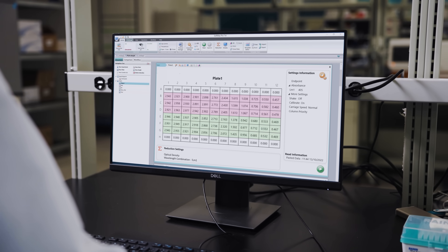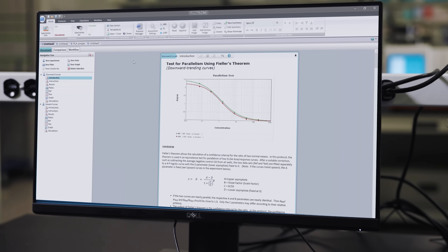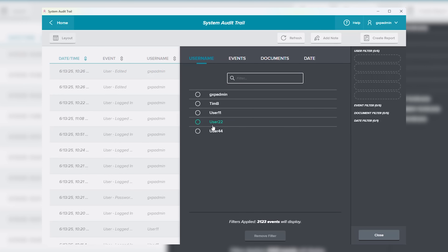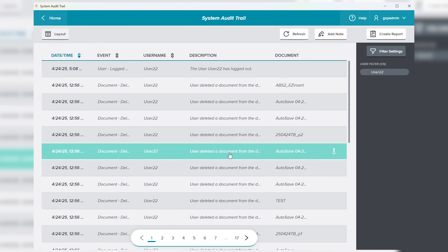SoftMax Pro software delivers powerful data acquisition and analysis with over 200 ready-to-run protocols for ELISA, cell viability, and more. Built-in compliance tools support FDA 21 CFR Part 11 data integrity requirements for regulated labs.